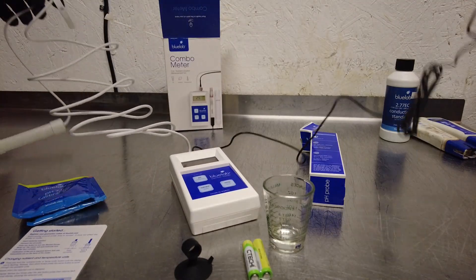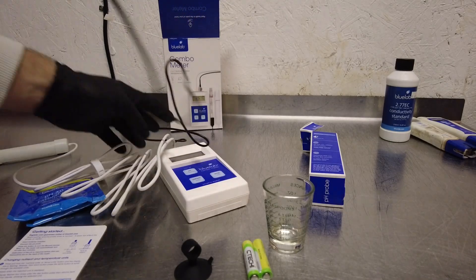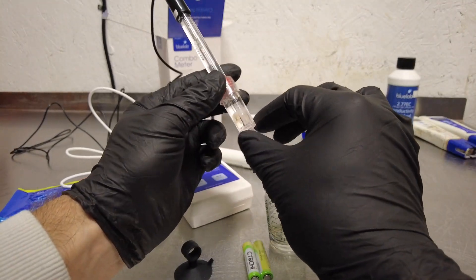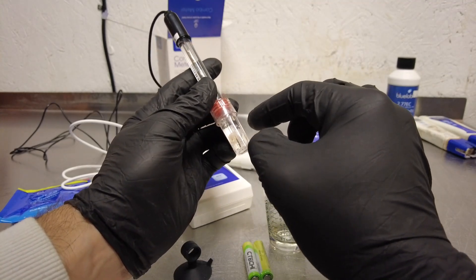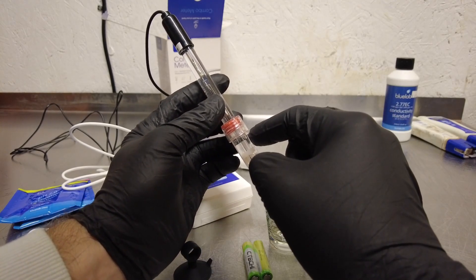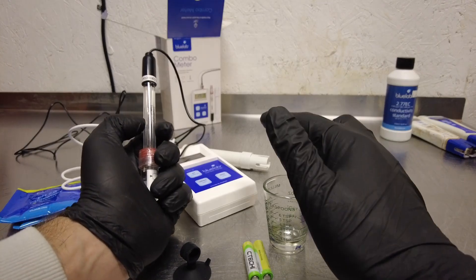These cables are pretty lengthy — definitely around six feet — so you've got some distance, which is nice. One thing you'll notice on the pH probe is it comes with KCl solution in the storage cap. You always have to make sure the probe tip is covered in that solution. Never store it in reverse osmosis, distilled, or deionized water — that screws up the chemistry of the probe and pretty much kills it.